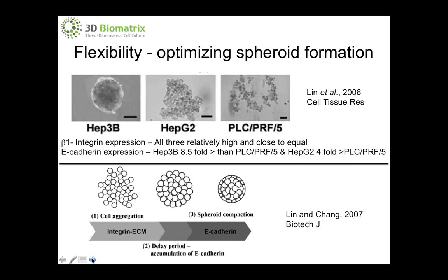So a big advantage for the hanging drop plates is to be able to add media-soluble extracellular matrix, for example 2.5% Matrigel, or other matrix components, or packing agents such as methylcellulose or perhaps polyvinyl alcohol, either at the time of plating cells or a few hours later, to alter spheroid formation and timing and compactness to suit your experimental timeline. So you can use this to set up a model that closely mimics the physiology that you're trying to generate.